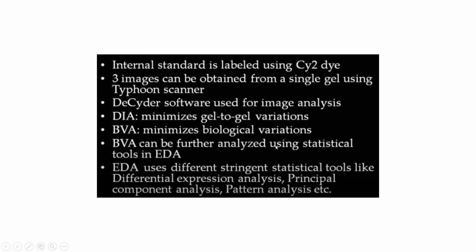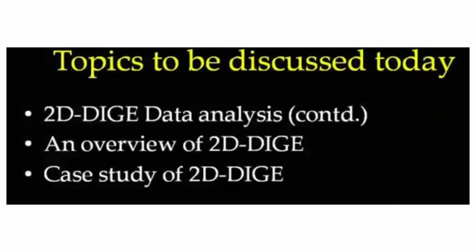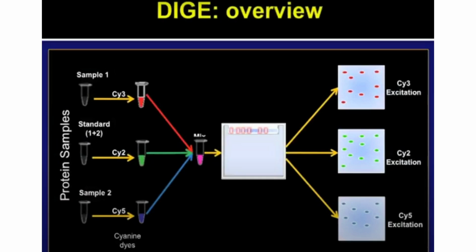So you can tell the image software itself that this is the internal standard, consider only those in your sample 1 and sample 2 visualization. So accordingly it will give you everything, the image analysis what we have just seen. Similar to that, this image analysis will also work. So this is how the visualization will look like.